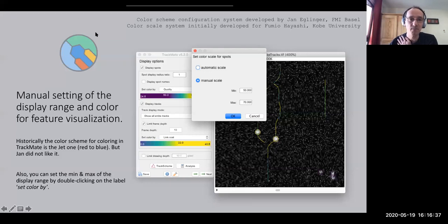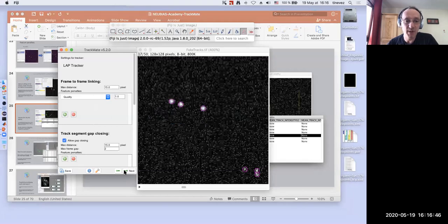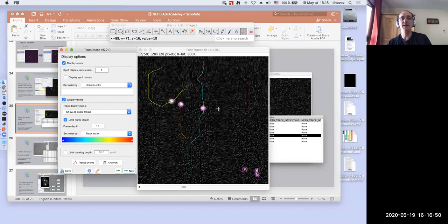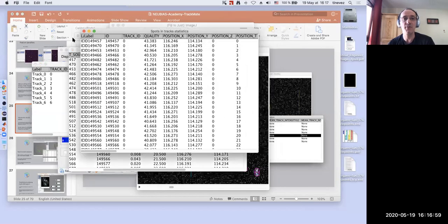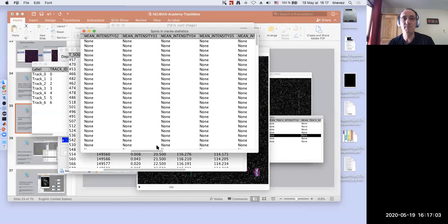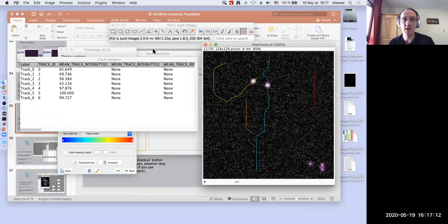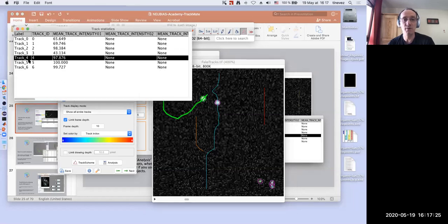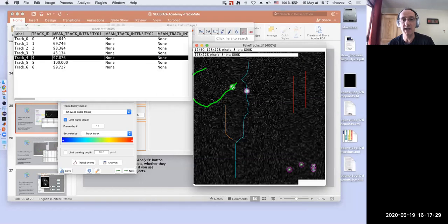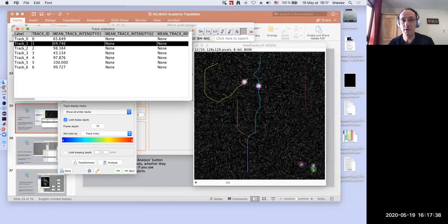The interactive results table: if you click the analysis button, TrackMate generates three tables for feature values — spots with X, Y, Z, quality, mean intensity, median intensity, etc.; links; and tracks. What's important is that these tables are interactive — when you click a line in the track table, it highlights the corresponding track in the image. That works for spots and individual links too. Very handy if you want to retrieve where you are.